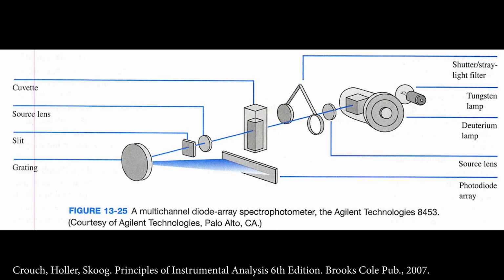Okay, so here's again a specific. We don't have this instrument, but we do have several photodiode array little instruments. I used a photodiode array instrument to look at your making solutions stuff the first time. They're going to be a single beam instrument, but it's kind of a different phenomenon.